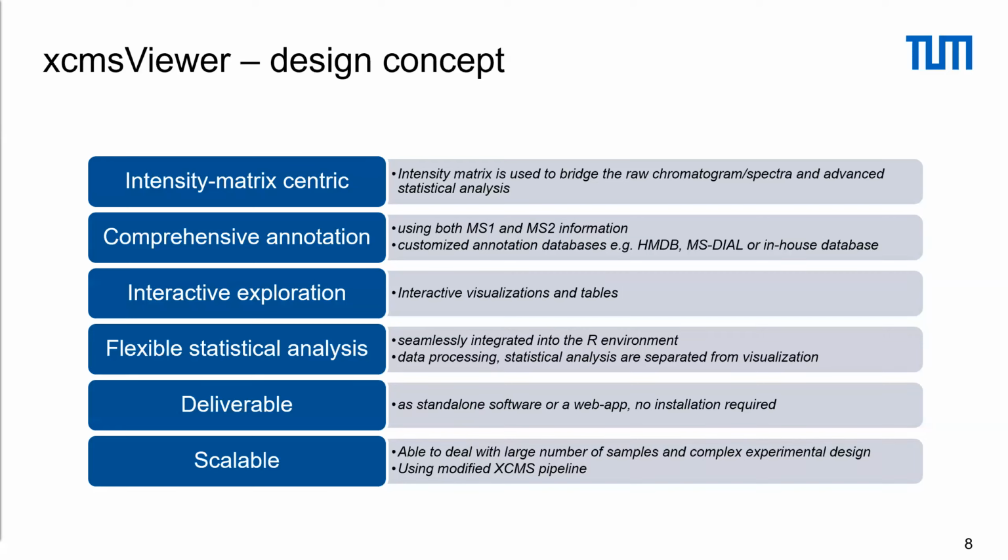Because most of the time we want to use untargeted metabolomics to generate hypotheses, we need to explore many metabolites. For every metabolite, we need to check their chromatogram. Do they look good? MS2 peaks, do they map well with known metabolites? Or if the metabolite is top ranked or selected by the t-test, we need to check the fold change, we need to check the p-value, many different things.